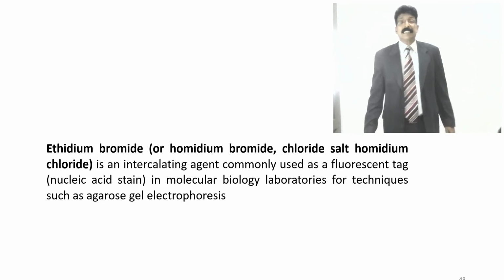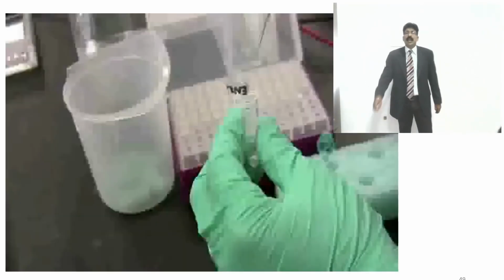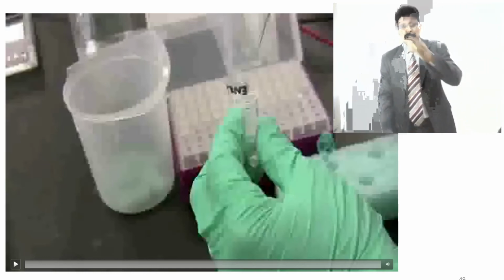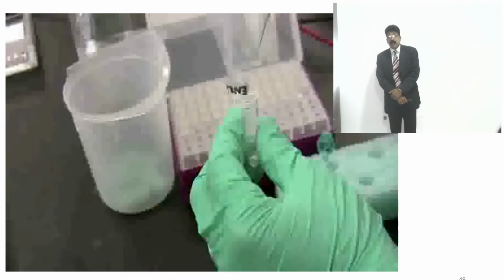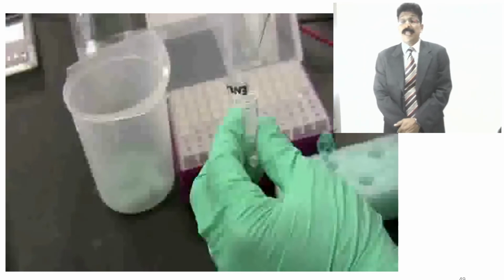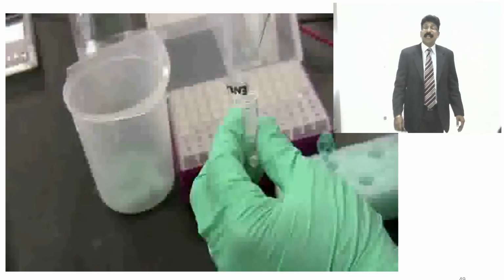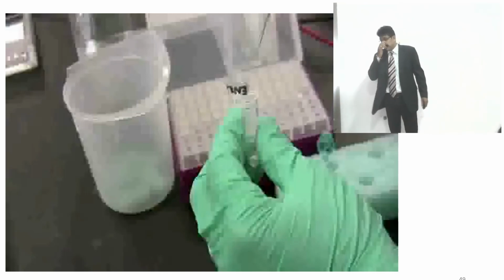So now we want to see how they perform this agarose experiment. Especially, we should know that there are many enzymes responsible for breaking down this DNA when you add a molecule of a herbal product. There are 3,000 to 4,000 enzymes available nowadays, and these enzymes will break down the DNA, and depending on how much the molecule is broken down, the movement of the DNA will vary. So each DNA can be specifically and very clearly identified.